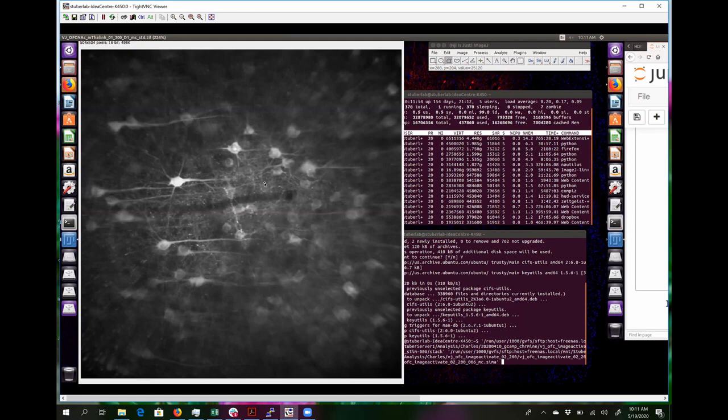Yeah, at least in my experience with the large GRIN lenses, the amount of movement is not significant. If you want perfect alignment of fields of view across days, I'd say maybe 80% of the mice that I do surgeries on are good. But if you want mostly the same cells to be picked up, practically all of them are good. Okay, cool. Good to know. So just something to keep in mind, I guess. Yeah.